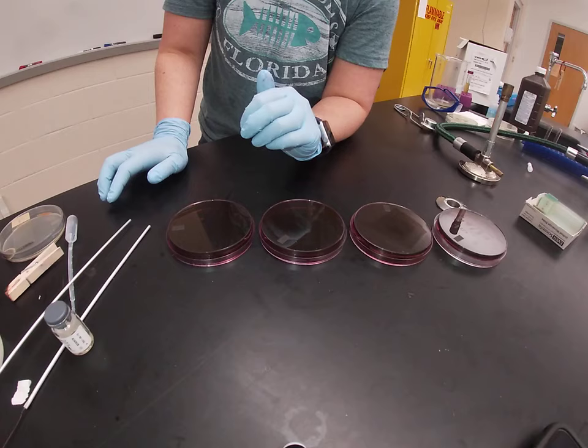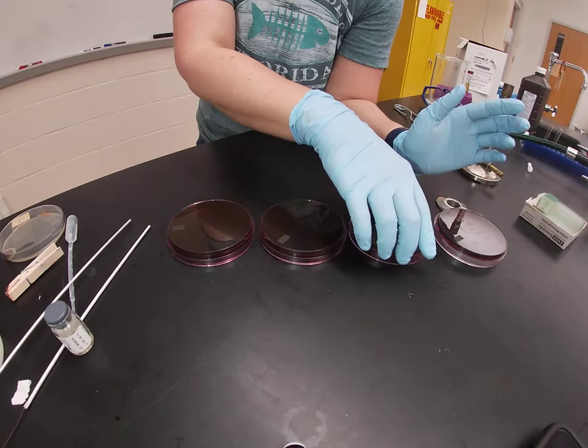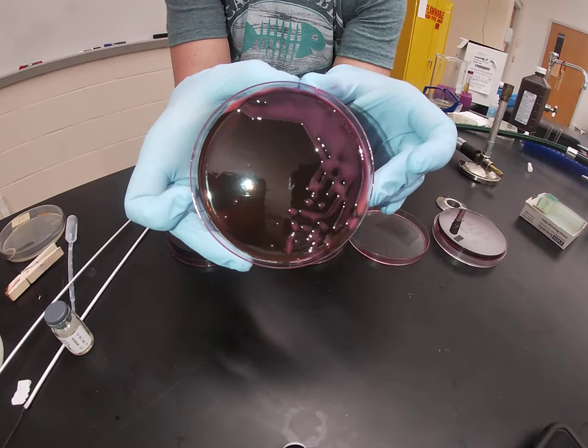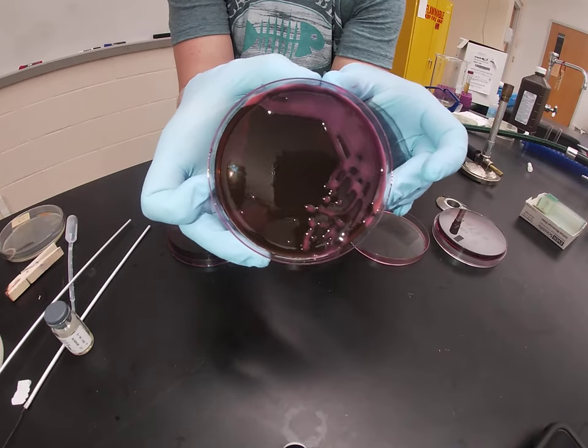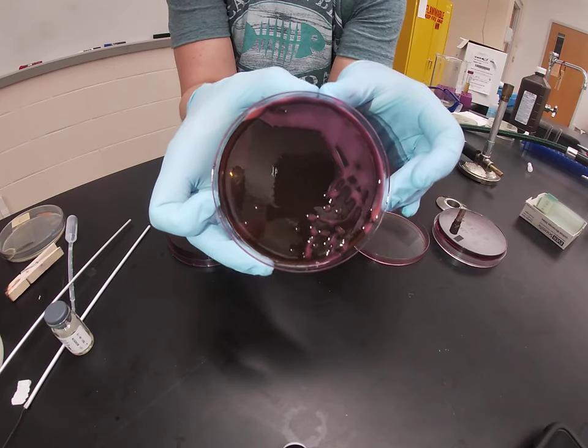Organisms that are able to ferment lactose but at a normal or slow rate grow pink on this agar. You can see that distinctive pink color — this organism does ferment lactose but it does not do so very quickly.